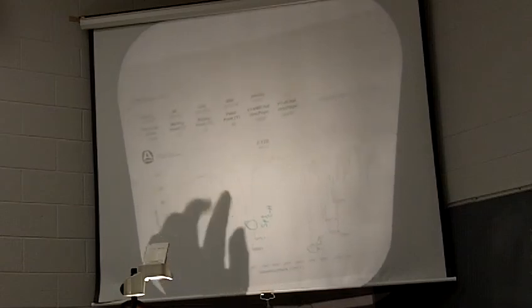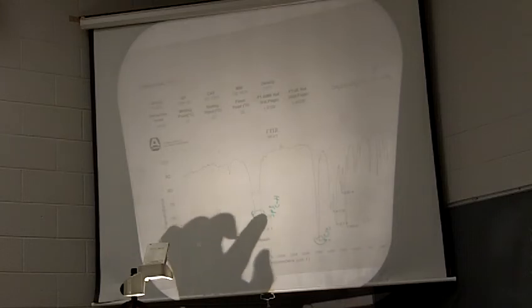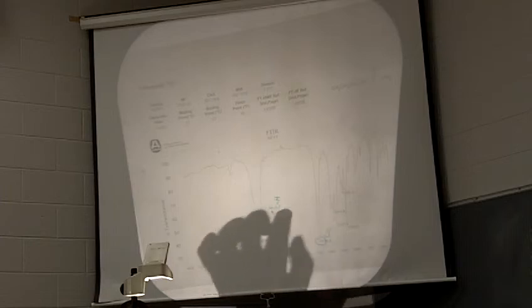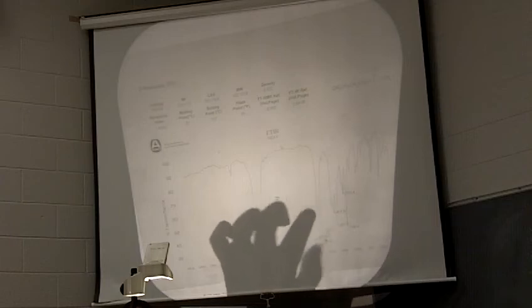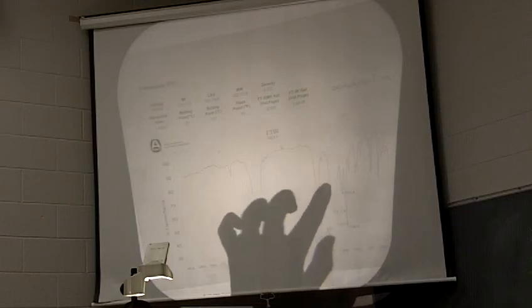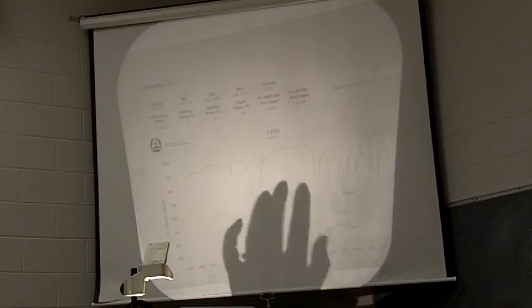So here's a ketone. We've got sp3CH stretching with the ketone, and then we also have the carbonyl. The carbonyl and the C double bond C sometimes get confused with each other, but the carbonyl is usually late 1600s to the 1700s. The C double bond C is going to be the early 1600s or late 1500s. Okay, so that's how you can tell the two apart.